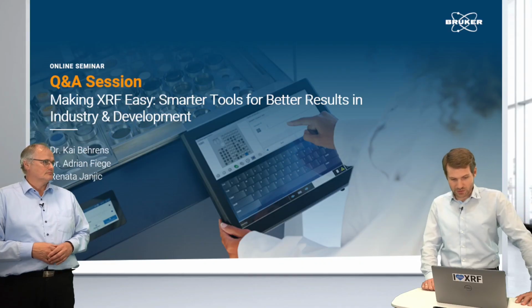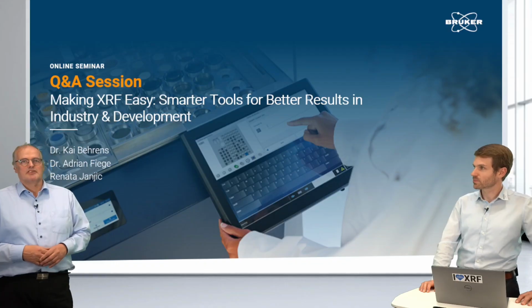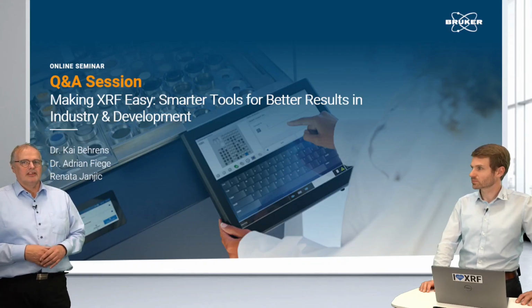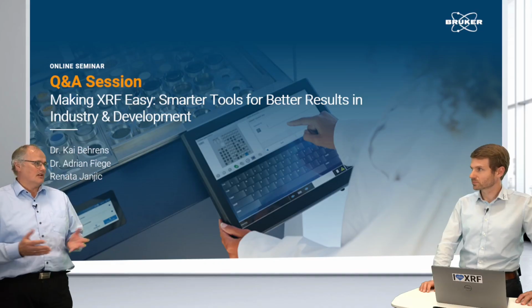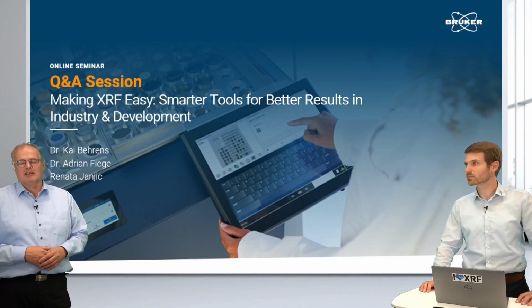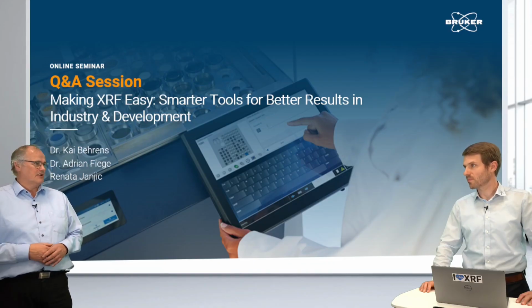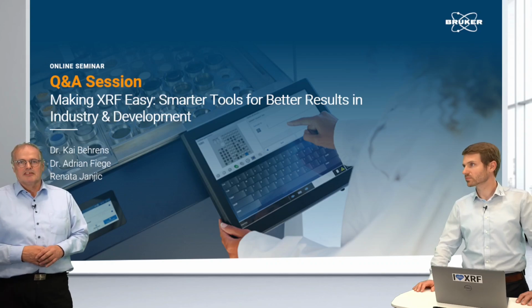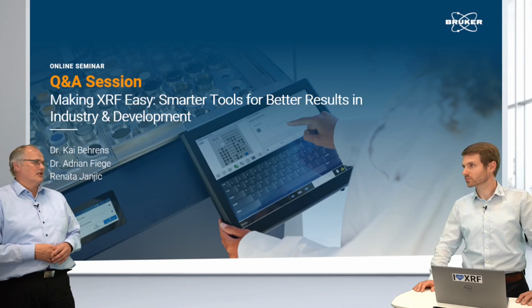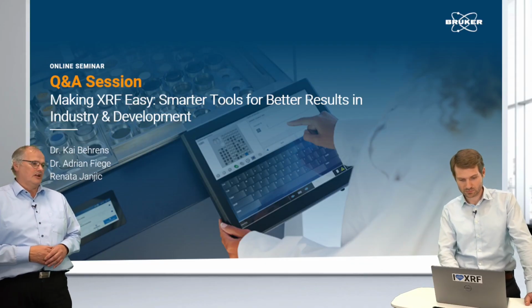And more a general question about data handling. Can I export my data or send my data to LIMS? Yeah, so the data out of the reporting software can be copy-pasted to any Office application. Also, in the moment you are providing by LIMS system or by barcode or by typing the exact name, actually the result will automatically be transferred to the LIMS system. This is possible, and that's a normal function in automation. Yeah, so we also can hook up the instrument to automated sample preparation.